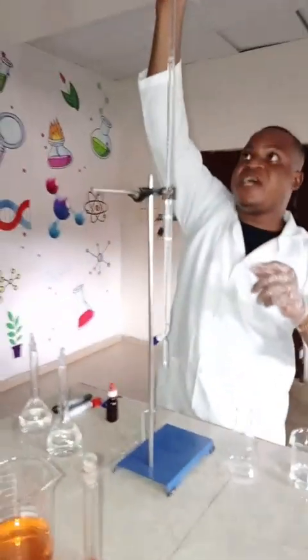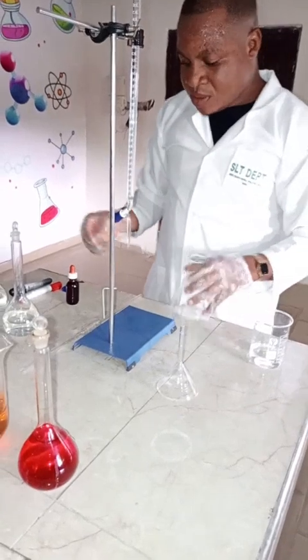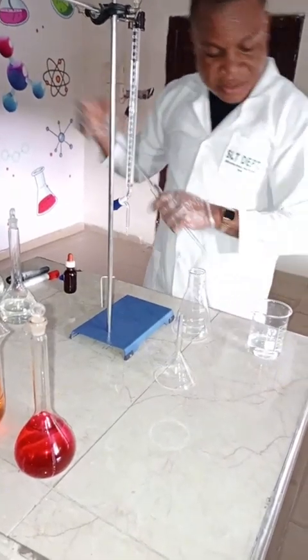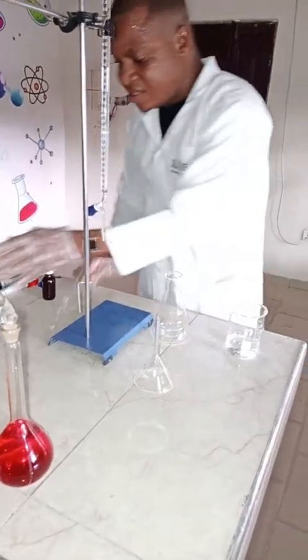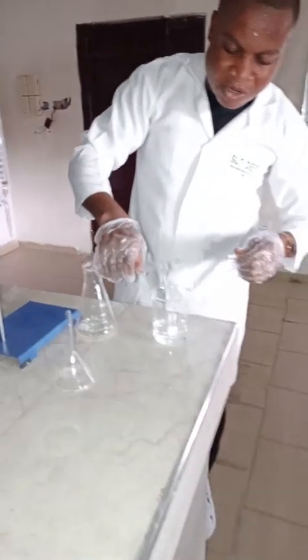I'm going to take off my funnel. I'm going to pipette another 25 ml of the base. I've told you this is my base. For easy pipetting, I will still fill up this.